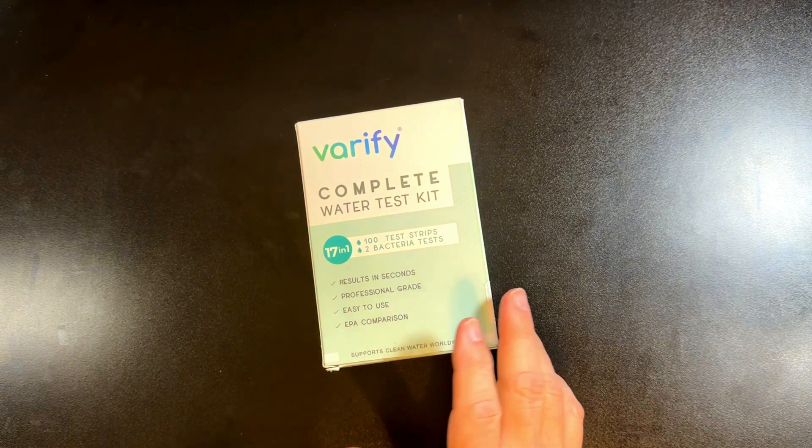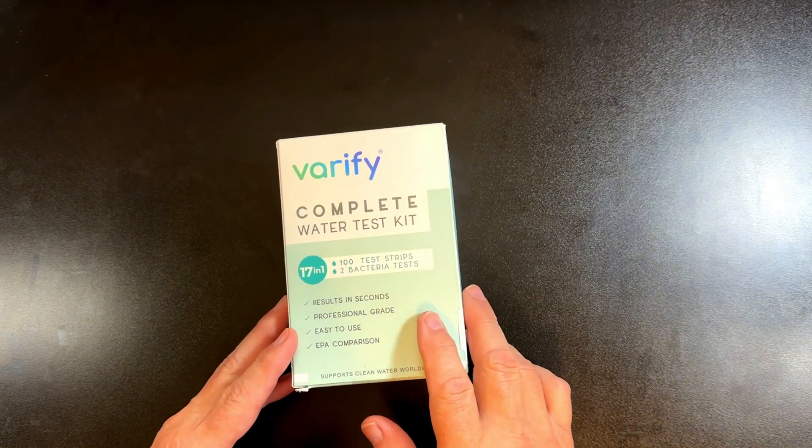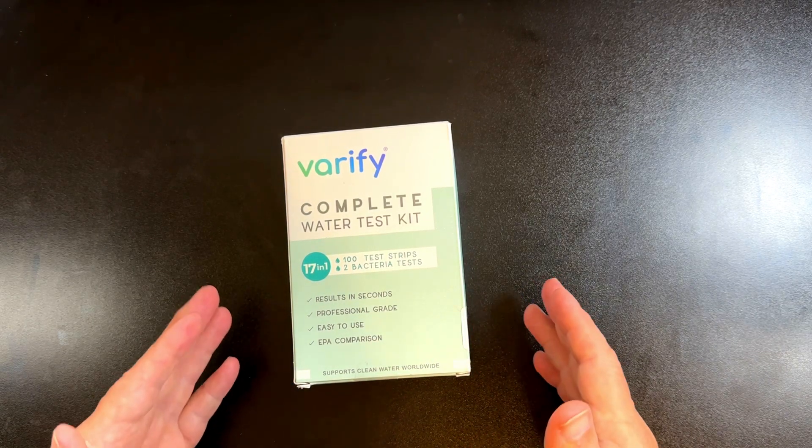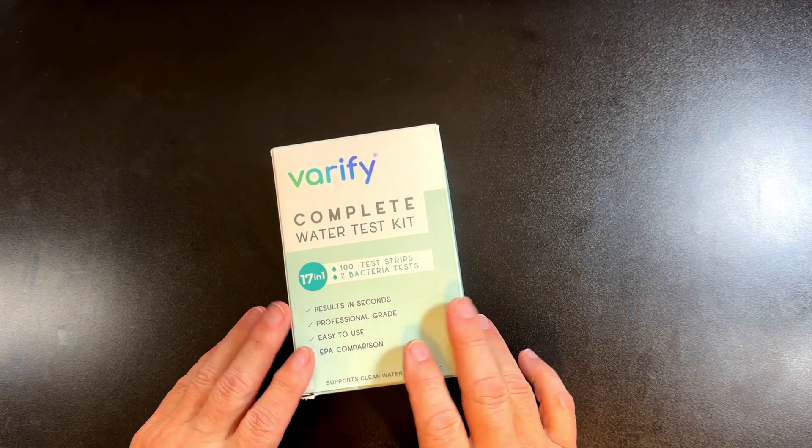Hi, my name's Alan. There have been so many news stories lately about townships and cities having terrible drinking water, so I decided to get a kit here.